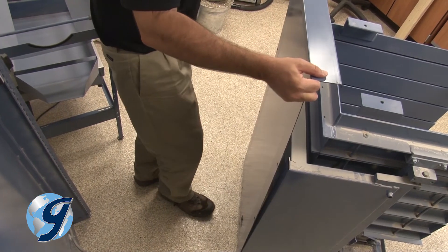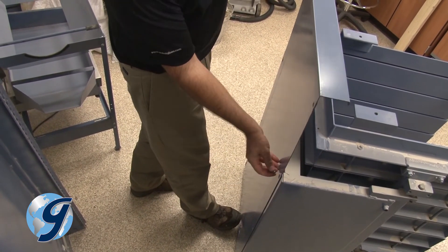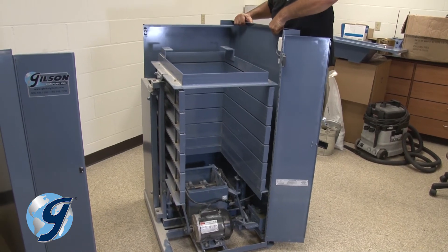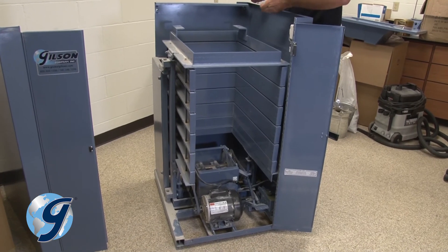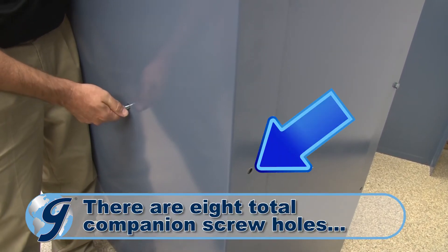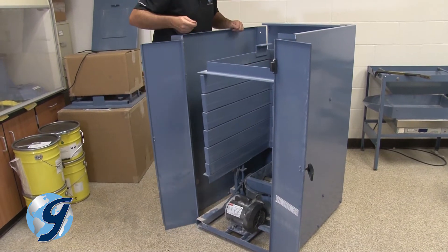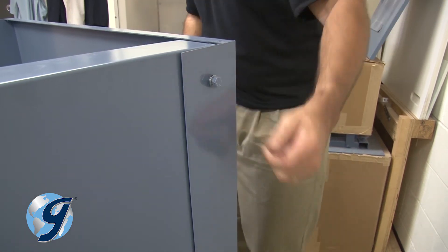Attach the rear panel and note the companion screw holes from the rear panel to the side panels. Do not over tighten the screws. Attach the right panel. Make note of the location of the timer so as not to damage it when reassembling the Test Master. You may need to move the panel around to line up companion screw holes from the right panel to the rear panel. Attach the left panel. You may need to move the panel around to line up the companion screw holes.